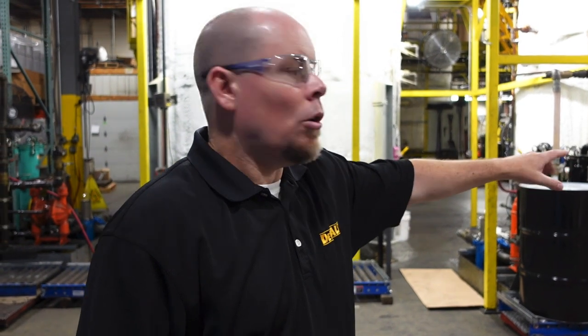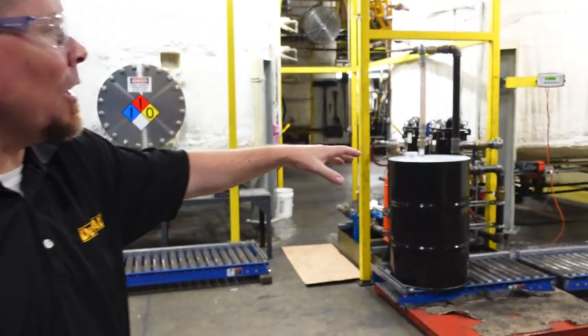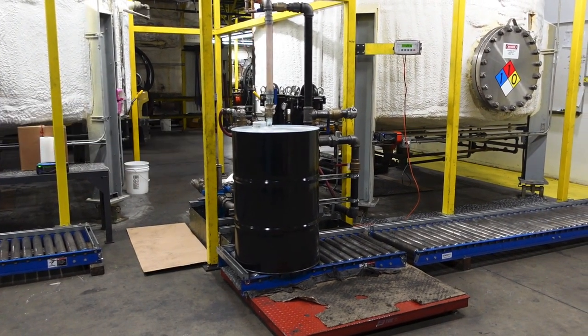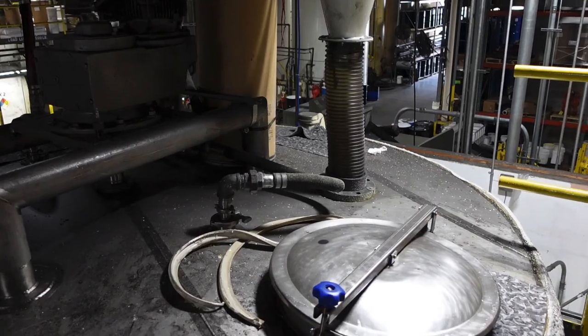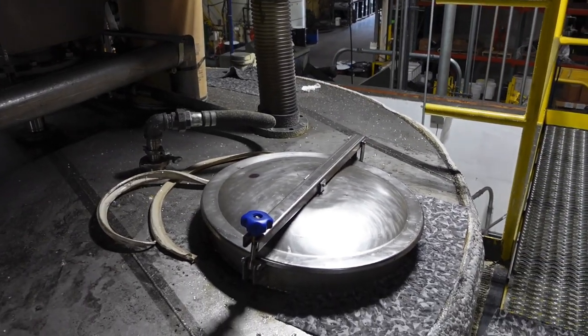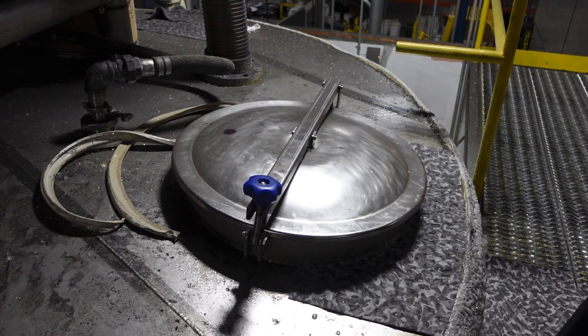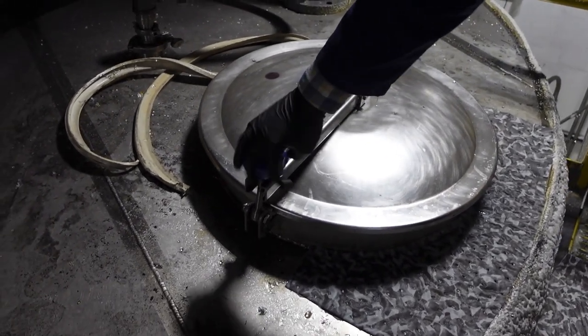These are high-end scales — take a picture of those because that's really important because everything is weighed in there. As each component is dropped in, it's weighed. These are actual scales — they're not just pedestals; they're high-end scales. So this is our K11 — this is an actual production tank for making finished lubricants like the Bar and Chain Oil. We'll show you down inside. This is essentially like a big KitchenAid mixer. It's really not going that fast, but it kind of builds a vortex.